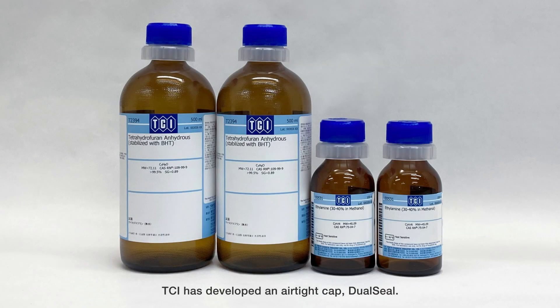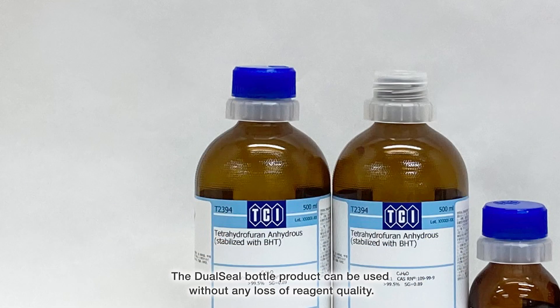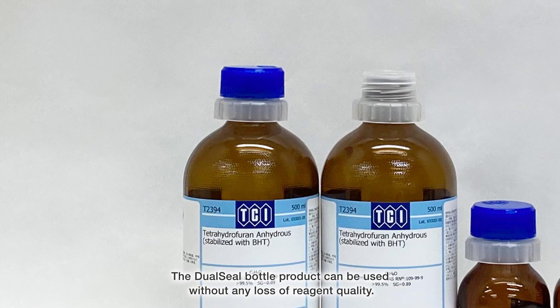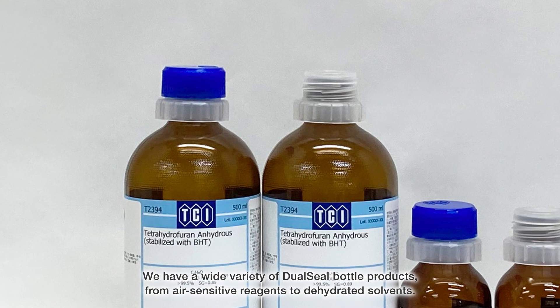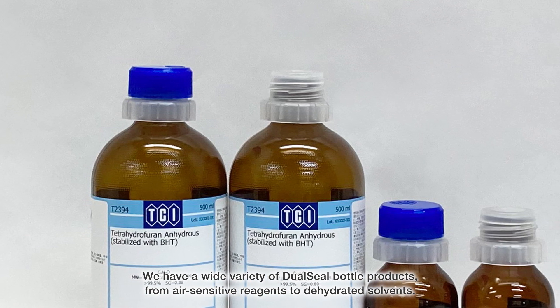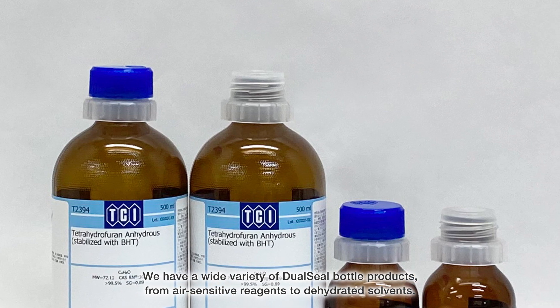TCI has developed an airtight cap called the dual seal. The dual seal features a double cap structure which ensures high air tightness. The dual seal bottle product can be used without any loss of reagent quality. We have a wide variety of dual seal bottle products, from air-sensitive reagents to dehydrated solvents.